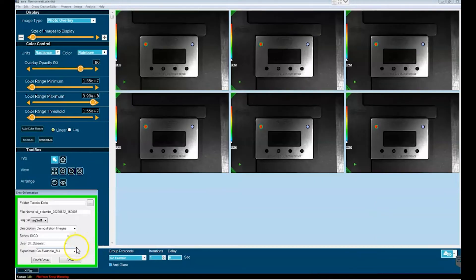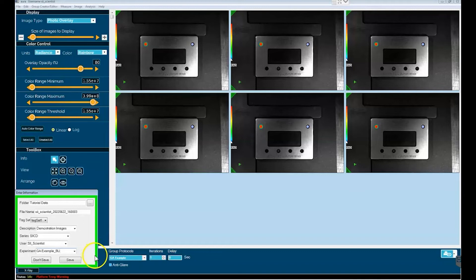With all six images acquired, the first thing that you should do is go ahead and save the image set before conducting an analysis.